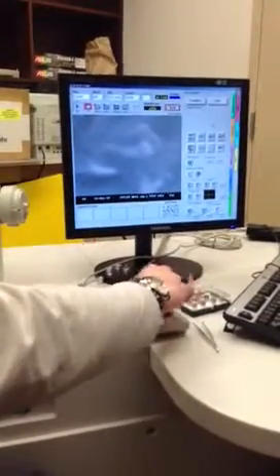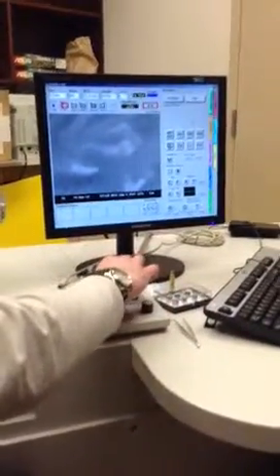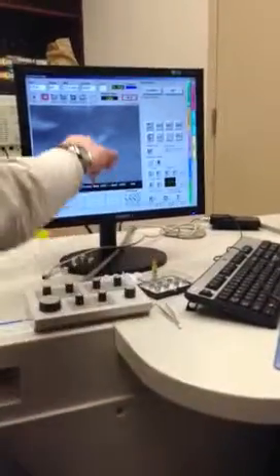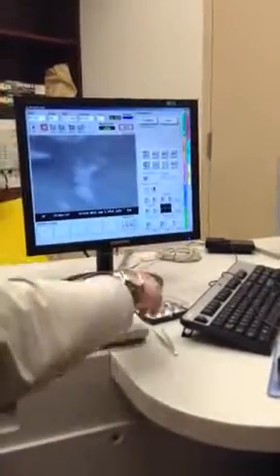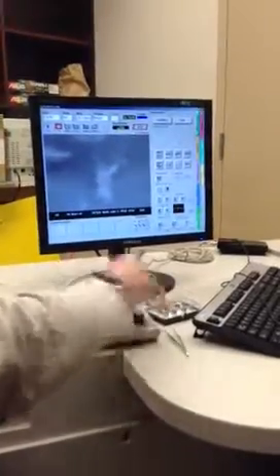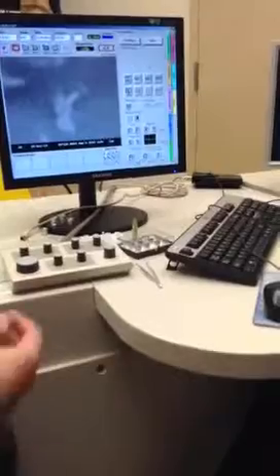The other thing you might notice as you zoom in a lot, it doesn't focus very well. Partially that, and also, let's see here. It's actually not too bad right now, but as I go through focus, if you look at some of these features, you'll see when it starts to get blurry, things sort of smear in one direction, and then if you go through the other way, they kind of smear the other way. That's called astigmatism.